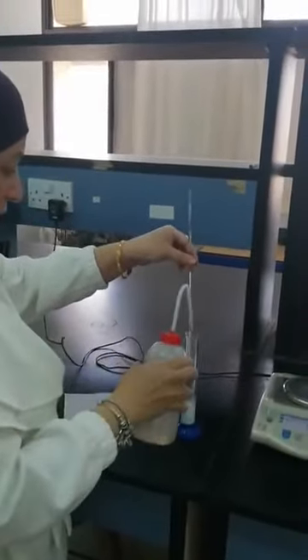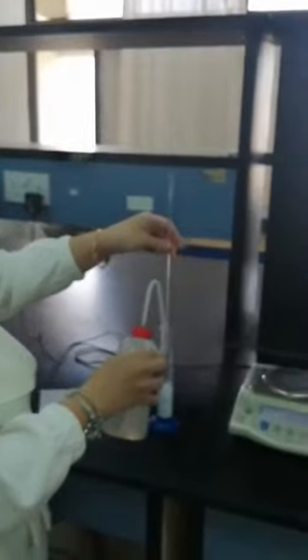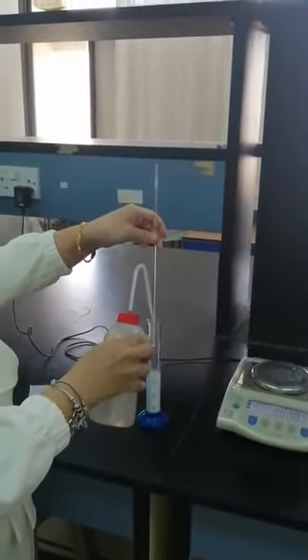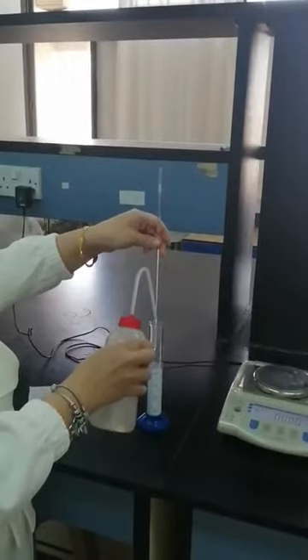To get an accurate result, I have to rinse the cylinder, but be careful not to exceed the volume of 50 ml.